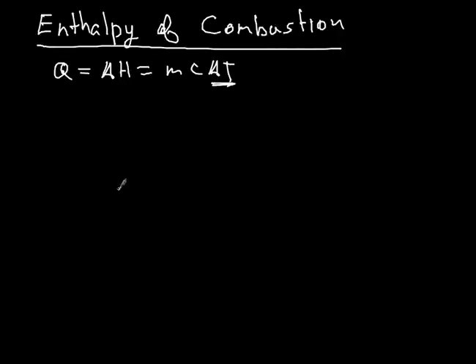Now, normally, when I have students do this as just a simple lab without me trying to help you do it better, I will use a Coke can. But you don't have to use a Coke can. You can use something else. And Coke cans are usually a little bit concave in the bottom. And you're going to burn something.